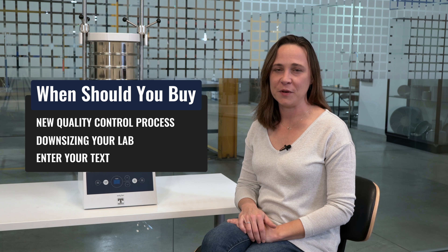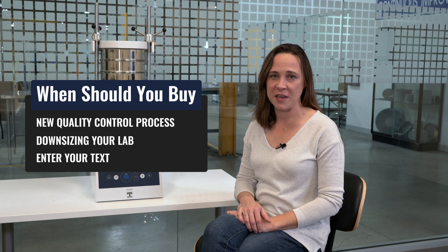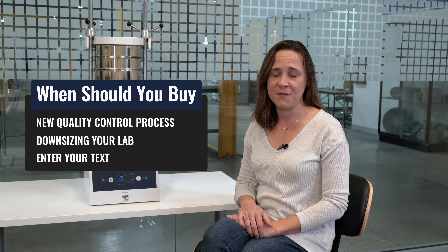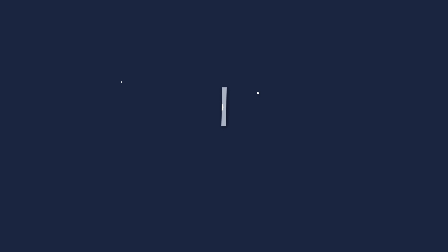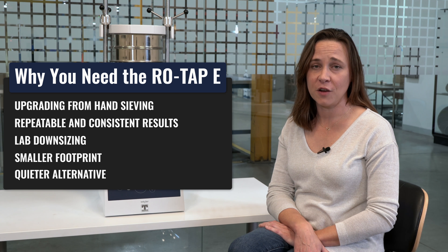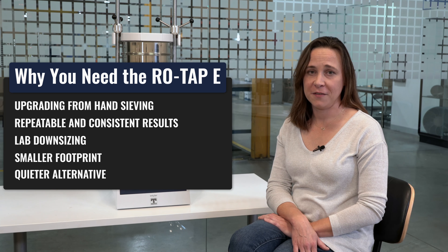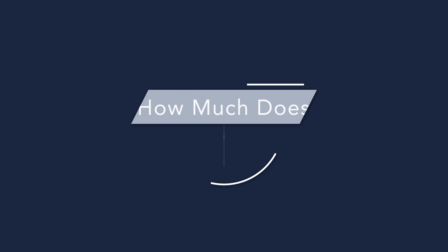You should consider the Rotat-B when you're setting up a new quality control process or when you're looking to replace your current mechanical shaker. It's also a good alternative if you're downsizing your lab or have a smaller footprint in the lab, or if you're looking for a quieter alternative to your standard sieve shaker.